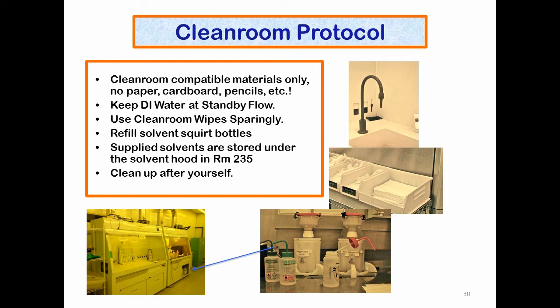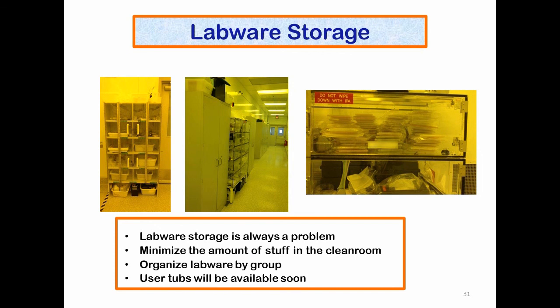Please remember to fill up solvent squirt bottles as necessary, and be aware that solvents are stored under the solvent hood in room 235, and always clean up after yourself as you go. Labware storage is always a problem, so be aware to minimize the amount of materials that you bring into the clean room, and organize your labware by group. User tubs will soon be available for you to supply your labware storage in.